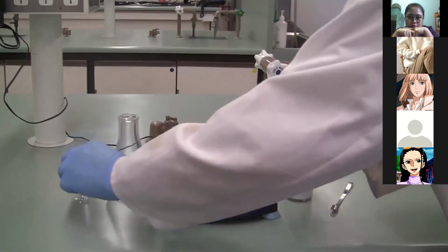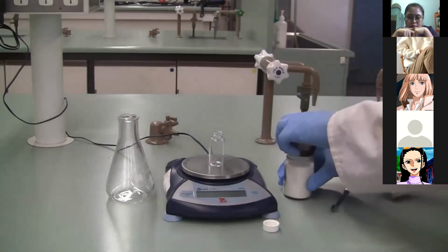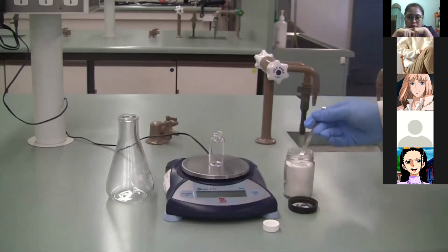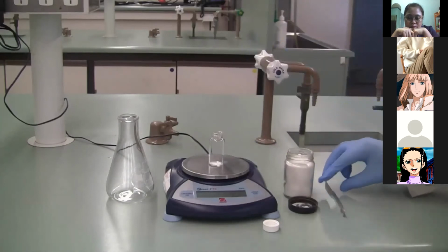In order to weigh by difference, start by taking your weighing vial, take the lid off and pop it on the top loading balance. You can then get your solid ready that you're going to be weighing out, zero the balance with your vial on, and then weigh in the approximate mass you need. So here I need about 0.2 to 0.3 grams. You can see on the balance that's about the right weight, so we're set there.